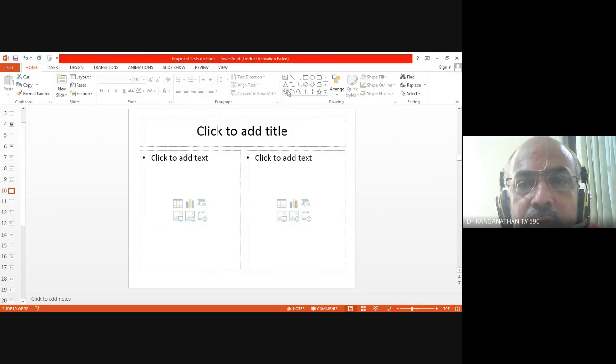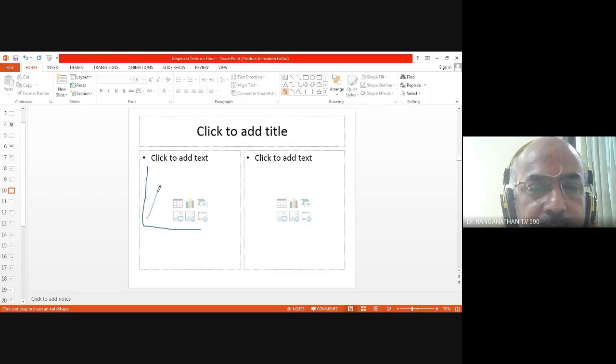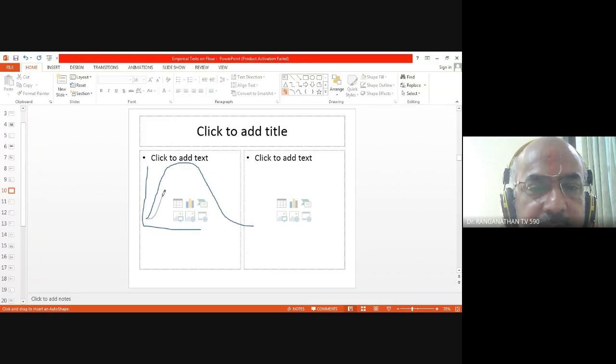Now, when this is pressure and this is length, fine. Now, in this case, what is done? You can have curves going for a long time and then breaking. The other can be something that withstands a high pressure, but then immediately falls down.